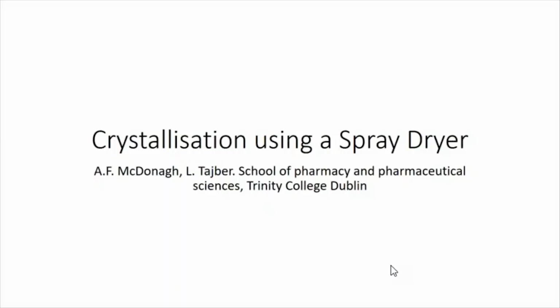I would like to talk to you today about the use of spray drying to crystallize materials through evaporation crystallization within a spray dryer. I will discuss a general overview of the process, the transfer of crystallization theory from a conventional crystallizer to that of a spray dried droplet, the use of models to characterize these droplets to allow for greater control over the crystallization process, and the role of spray drying parameters on the resulting crystallized material.